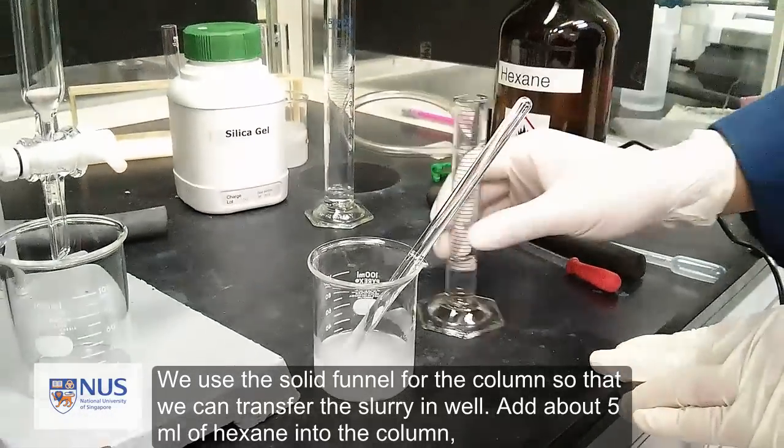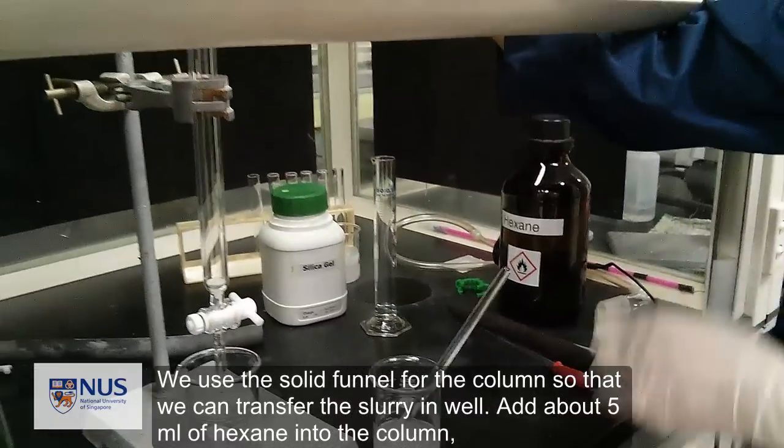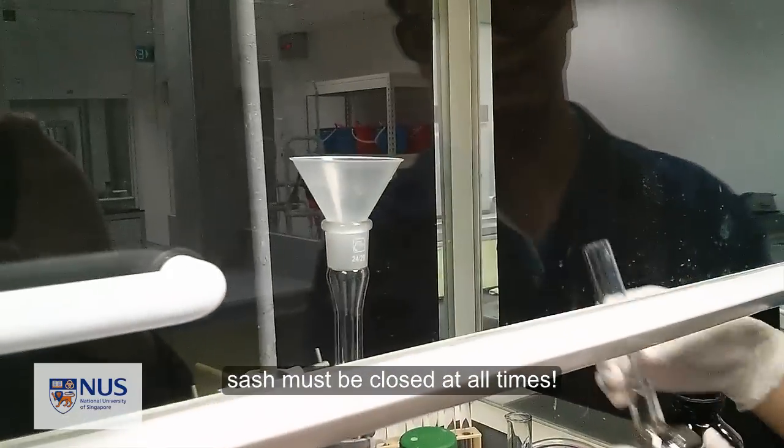Add about 5 ml of hexane into the column. At all times, the sash must be closed.